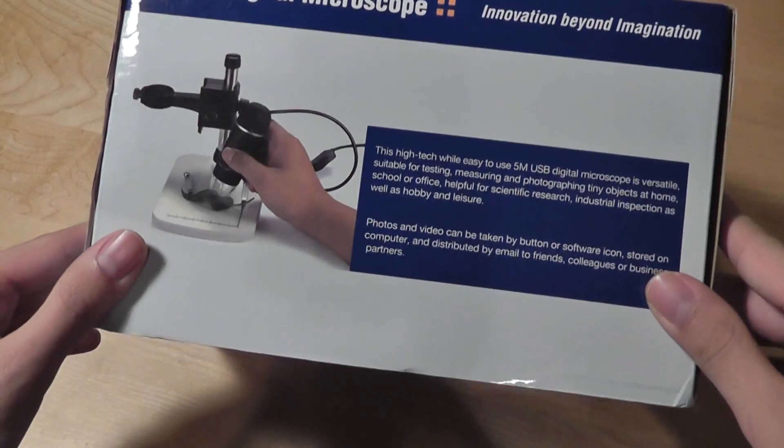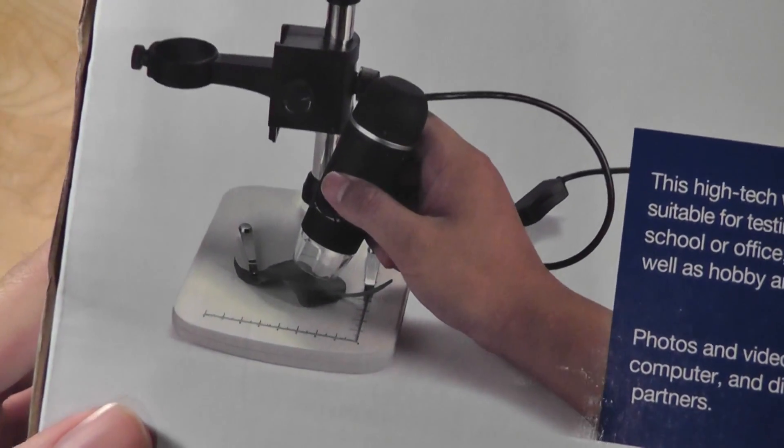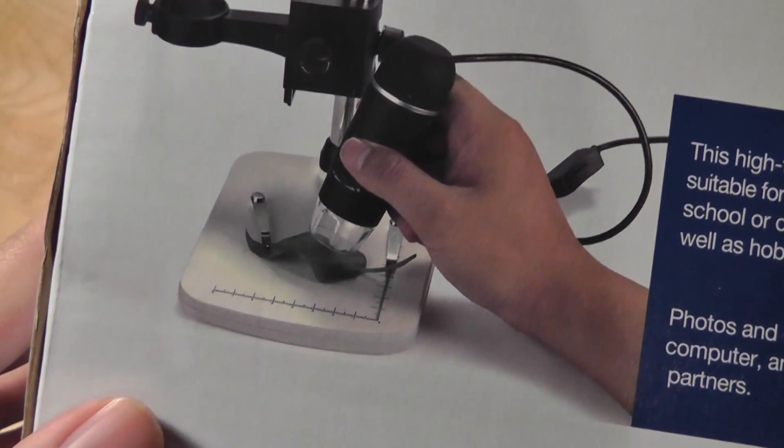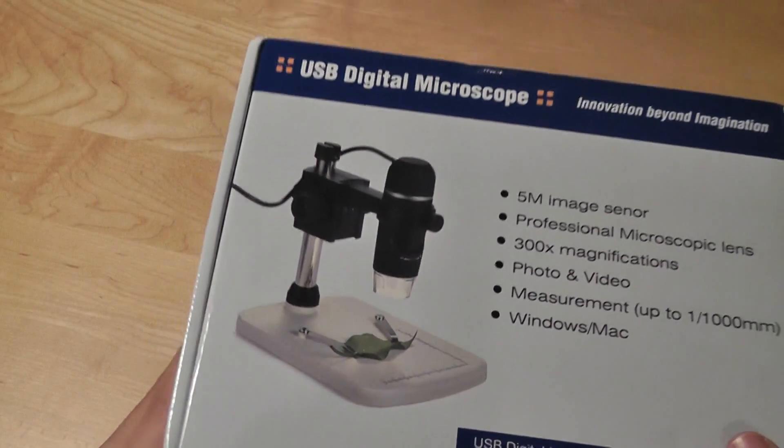Taking a look at the packaging here, it's pretty professional. You can see this is a microscope — you can take it out of the included stand to get up closer to your subjects, whatever you're taking a look at, and you can also have it adjusted on a pole that you can move up and down.